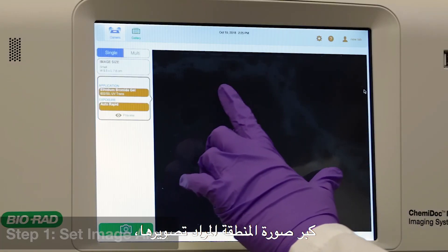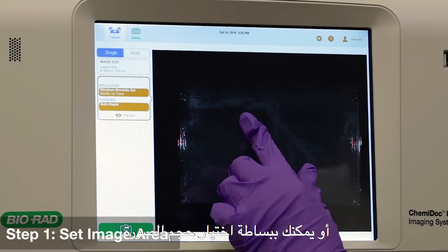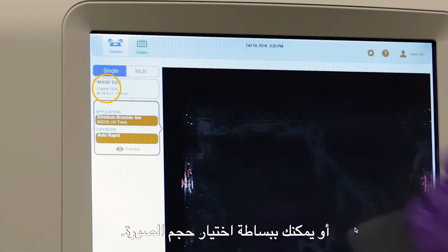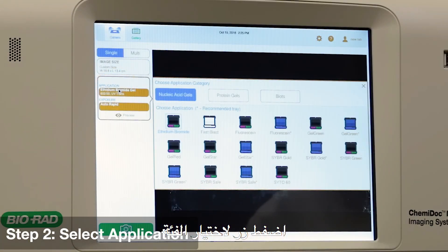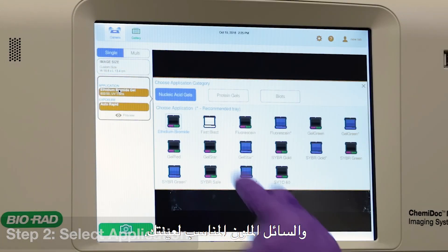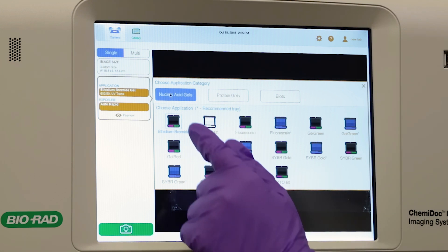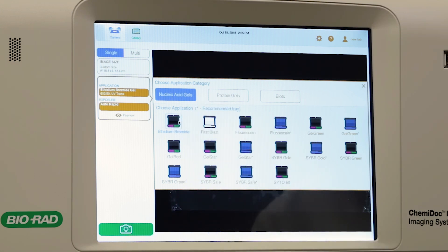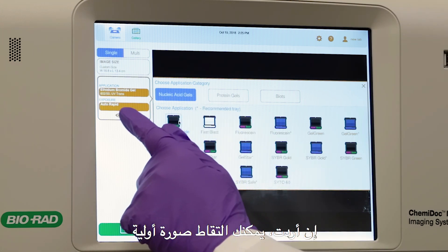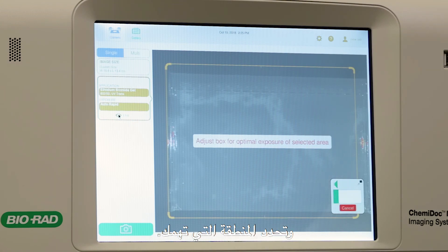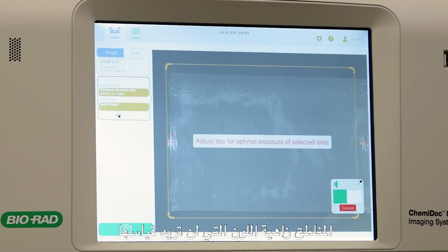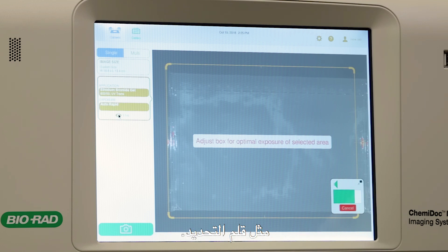Zoom in to the desired imaging area, or you can simply select image size. Tap application to select the category and stain appropriate for your sample. If desired, you may take a preview of your image and set your region of interest. This can be very useful for excluding very bright areas that you won't want to quantify, such as your marker.